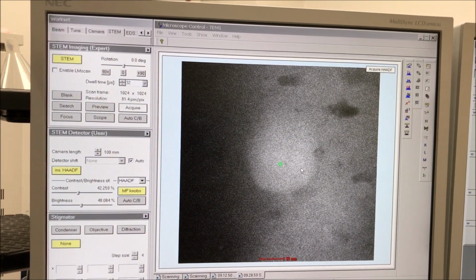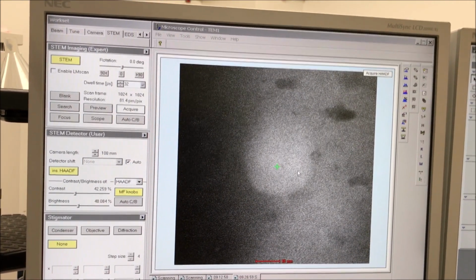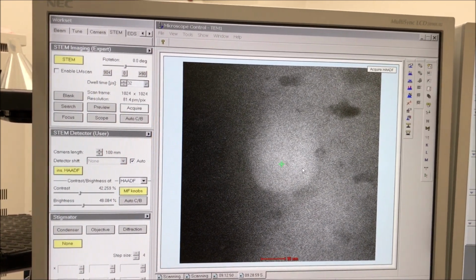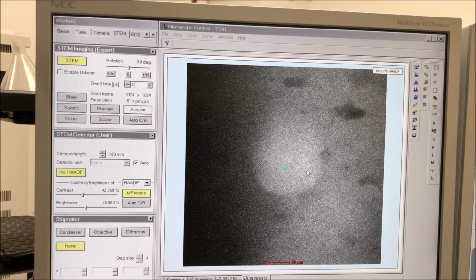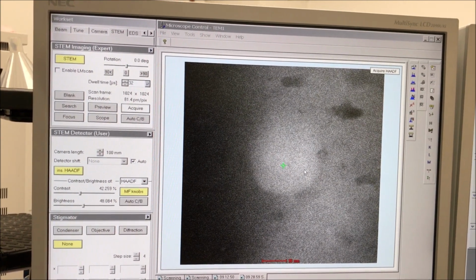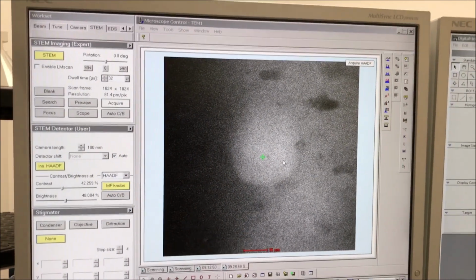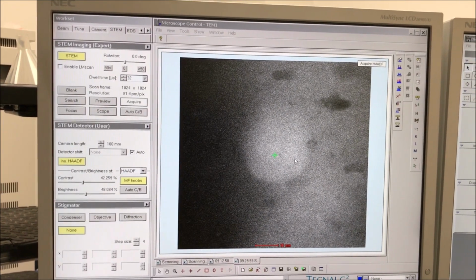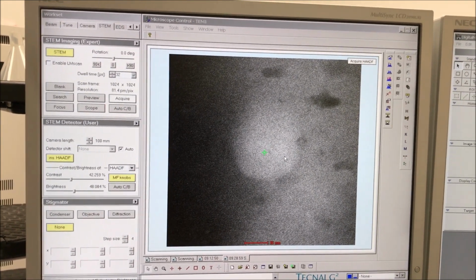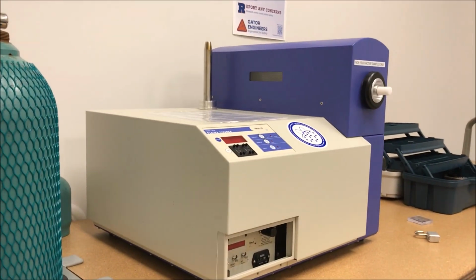Okay, so now the question is, because we've defined what the contamination is, how it happens, and why it's bad, we want to discuss how to deal with it. Obviously. So your first line of defense, actually there's a few lines of defense here, but your first line of defense is this guy. Okay, plasma clean your samples.